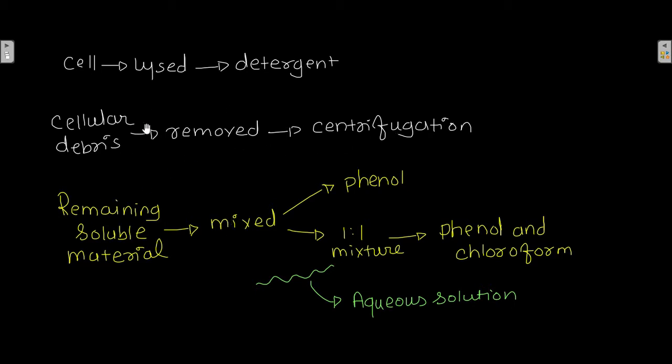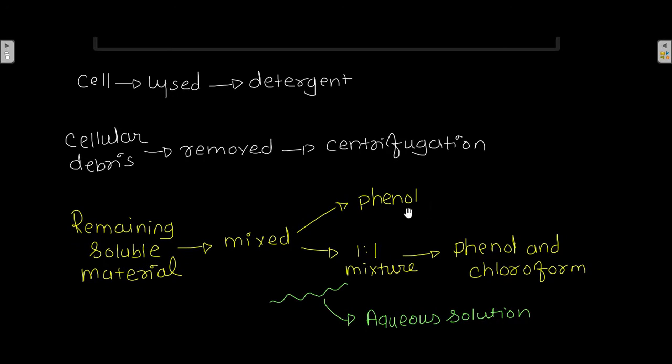After doing this, the remaining soluble material is mixed with phenol or a 1:1 mixture of phenol and chloroform.